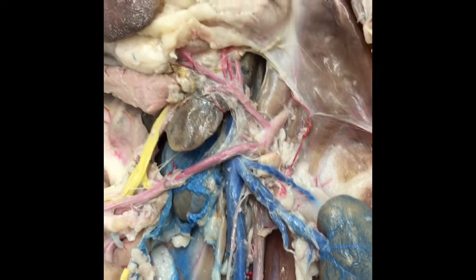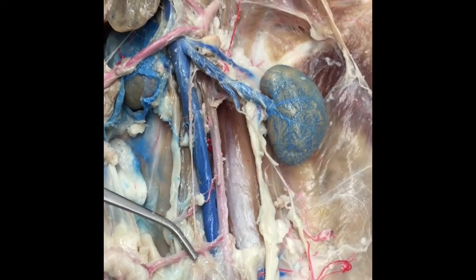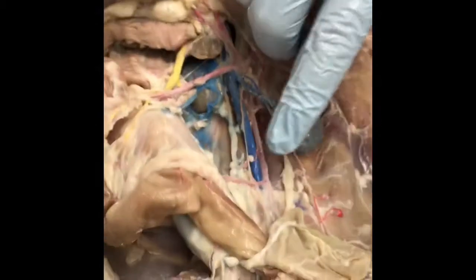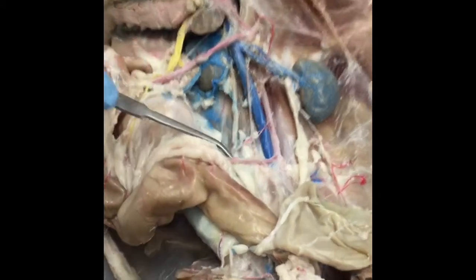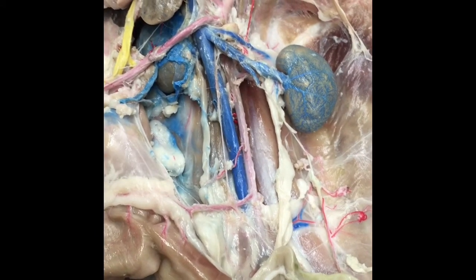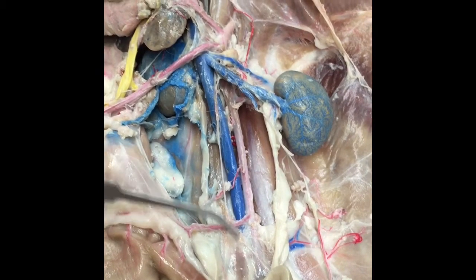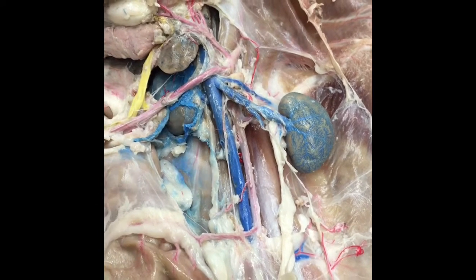Is that it? Yeah. That's the lower, or the cranial, is caudal. Caudal vein? Or caudal artery? No, caudal, this one. Yeah. So if you see it goes to the colon and rectum, that's mesentery. Caudal mesenteric artery. Yeah, where it's called caudal or posterior or inferior mesentery. So it's describing the caudal position, posterior, or inferior mesenteric artery.